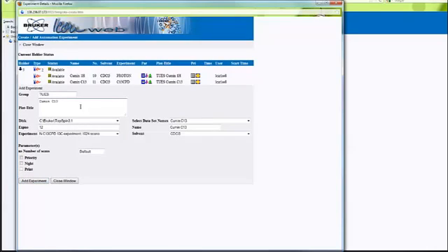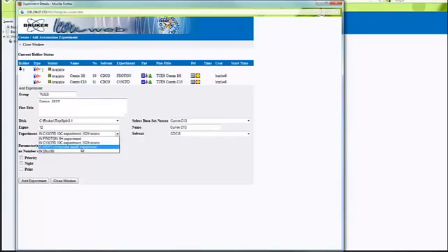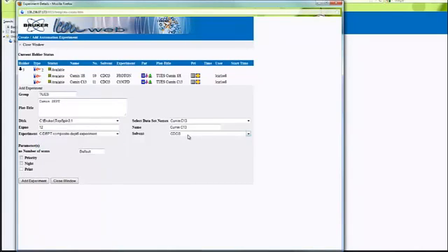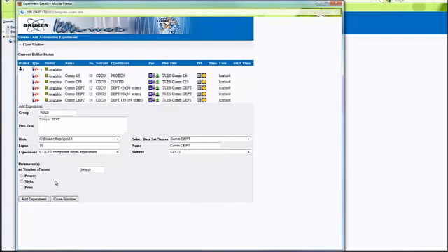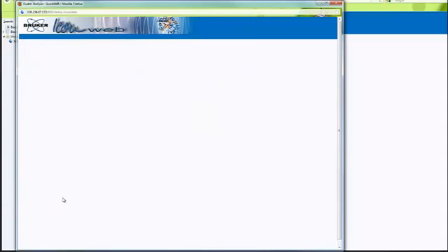Finally, I'd like to add a DEPT. So I'm going to do the exact same process, changing everything accordingly to DEPT. When you've added all of your experiments, click close window.